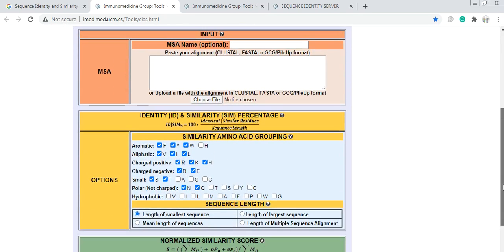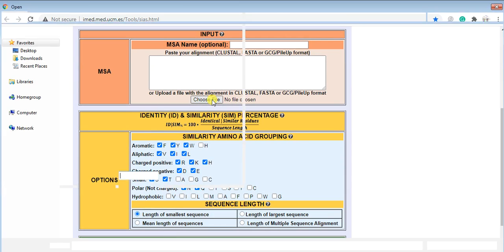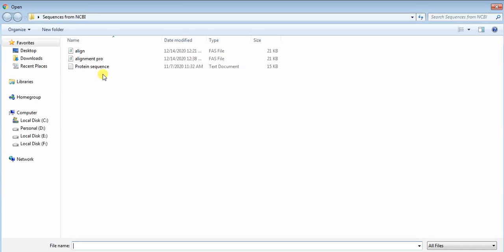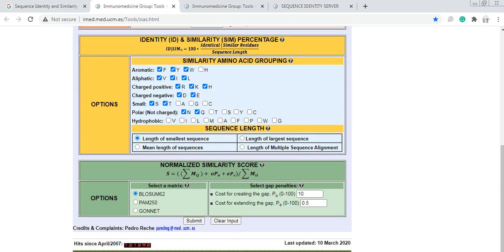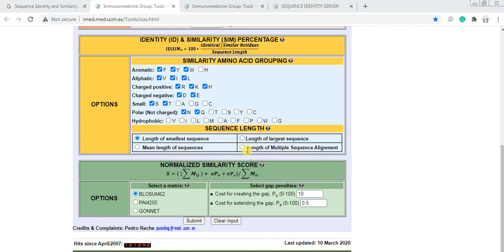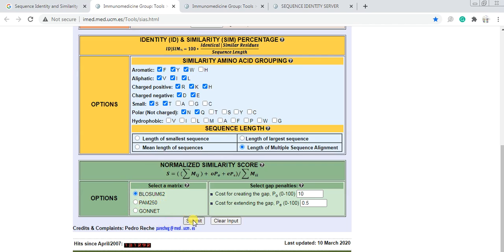Here upload your file, the alignment file that I just made. Here are options for length of smaller sequence, mean length, length of larger sequence, or length of multiple sequence alignment. Choose length of multiple sequence alignment. Here are different methods or models you can use. BLOSUM62 is okay. Now you can submit it.